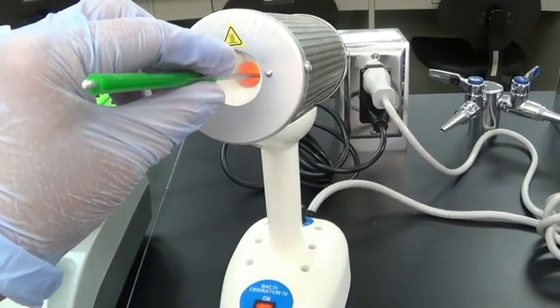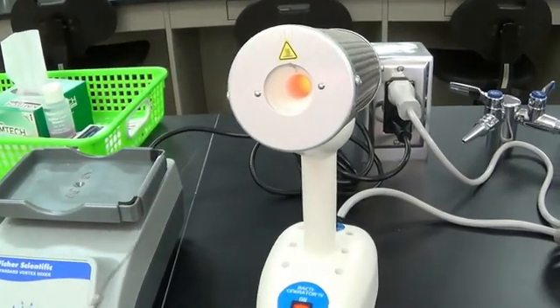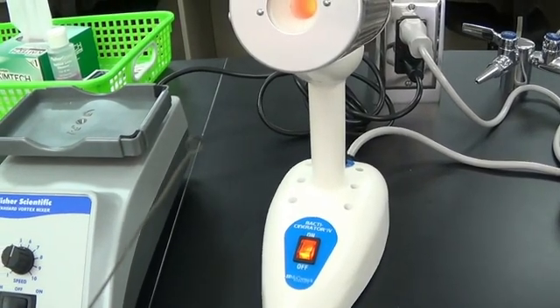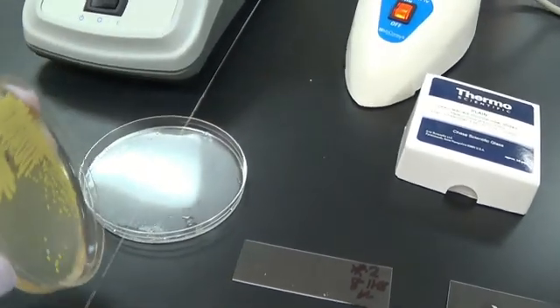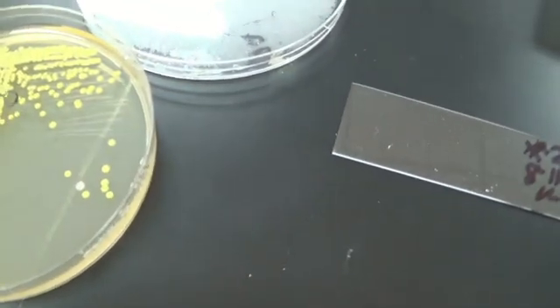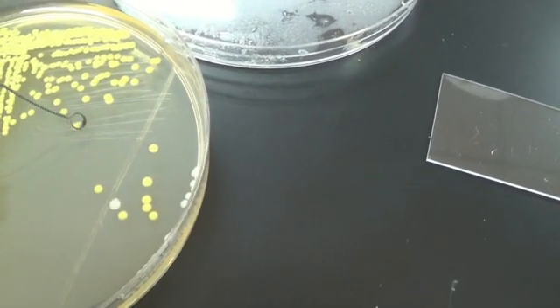Count to ten while sterilizing, then let the loop cool — count to ten again. Take your plate, and find a colony that is all by itself, because that is growing from one type of bacteria. Then just spread it around in the water.